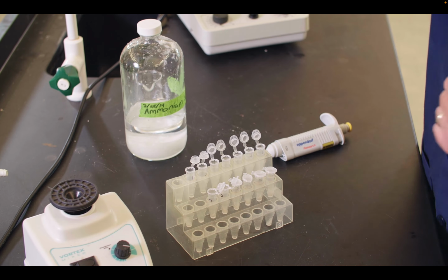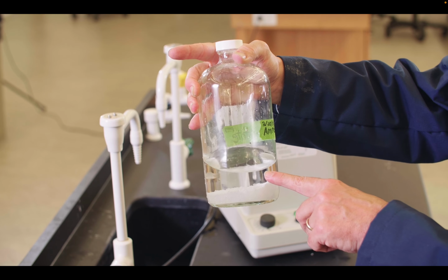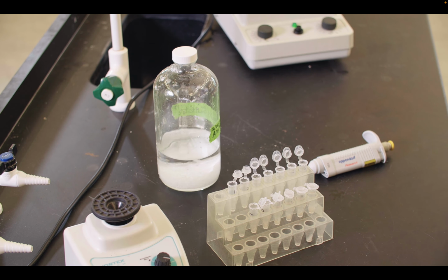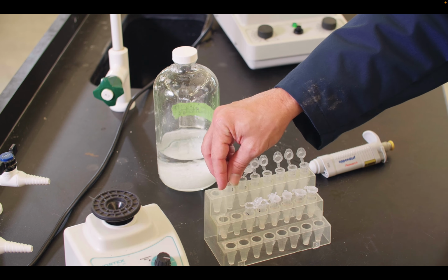We're going to have a developmental ammonium sulfate table that you see on the screen. And so effectively what we're going to do is we're going to have our ammonium sulfate. See this? It's saturated, and you can tell that because we have some ammonium sulfate still on the bottom and liquid above it. And so that means we have a lot of that in solution. It's saturated. And so what we've done is each one of 7 tubes, we've added 0.4 milliliters of our fraction 2. For test tube 1 here, we're just going to have it by itself. That's going to sort of be our standard.